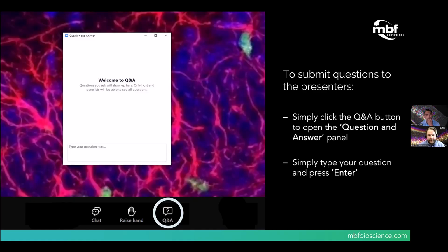See another question here about how long it takes to scan a whole mouse brain. It really depends on the mouse brain and the clearing technique that you're using and what detection magnification you're using. Acquisitions could be as quick as an hour or two, but the system is designed to run for days on end. So no matter how long it does take, the system is reliable and you can scan as long as you need to acquire your data. So it could be anywhere from a few hours to something like 8 hours, depending on the sample and the fluorophores that you're using.